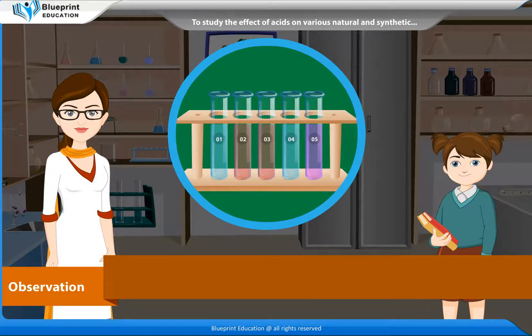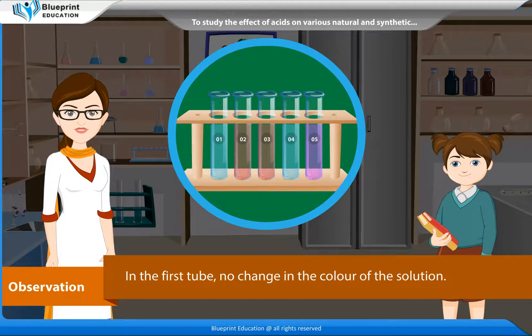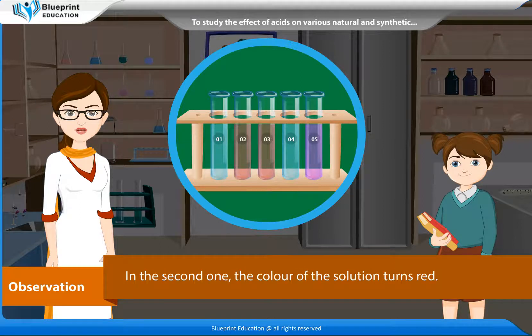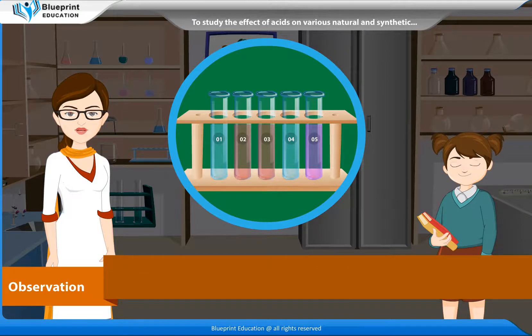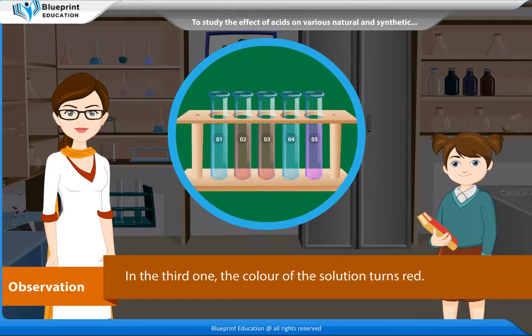Observations: In the first tube, there is no change in the color of the solution. In the second one, the color of the solution turns red. In the third one, the color of the solution turns red.